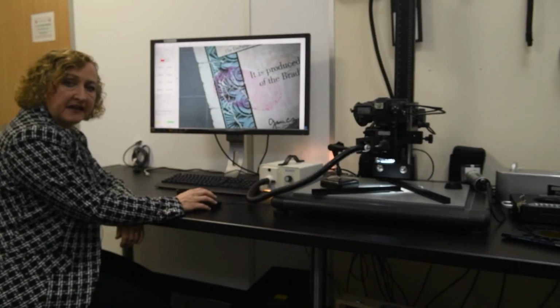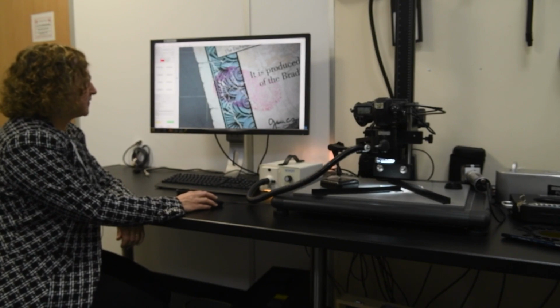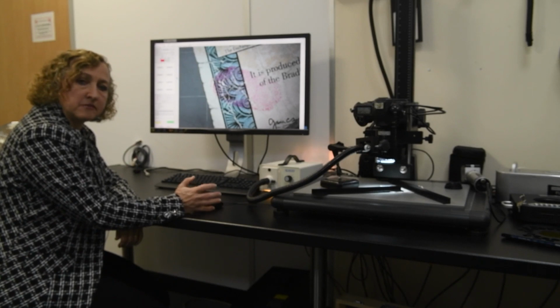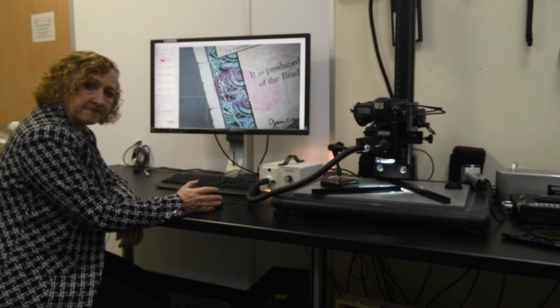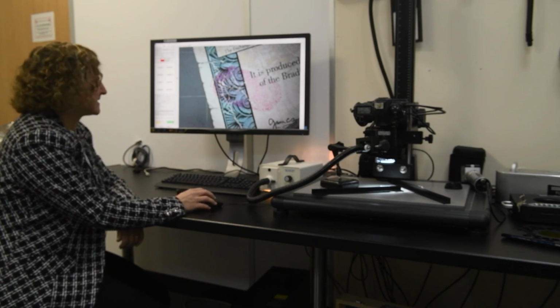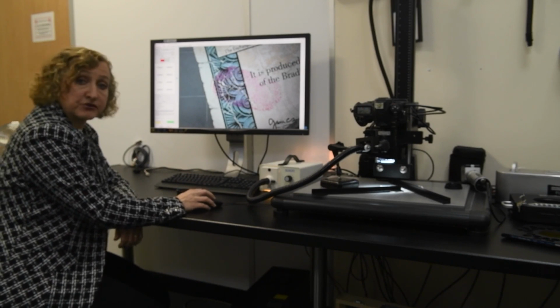The image that we have here has lots of different colors in the background. We have the black strips, the black pattern here. We also have a blue pattern. We have a white background, and we have the fingerprint expression itself, as well as text running through the background. So this really is a multicolored background. So again, I'm illuminating this specifically with daylight illumination, and I've made sure that it's looking correct on the screen.